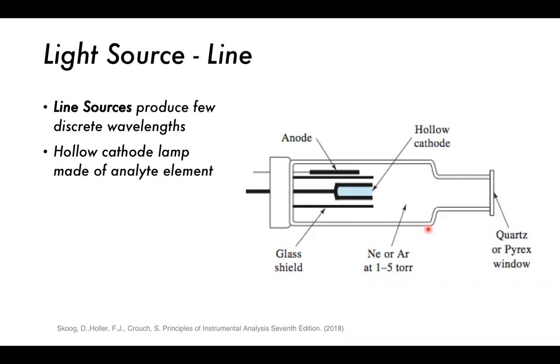So if you're involved with, I don't know, checking pollution or making sure that businesses are compliant with the local laws and not discharging hazardous waste into the water table or whatever, you can collect samples and you can measure them using these sorts of hollow cathode lamps, for the particular things that you're interested in. Maybe you think they're dumping too much copper into the local river. You can take river water samples nearby the factory and find out.